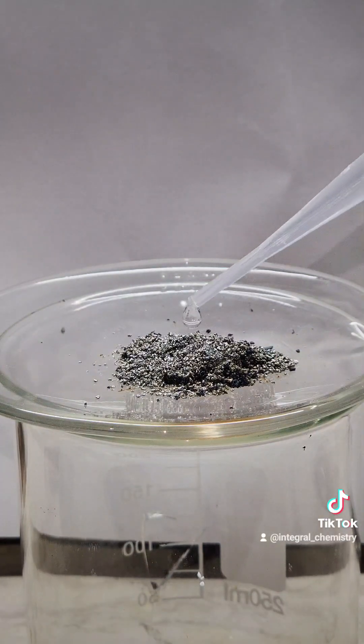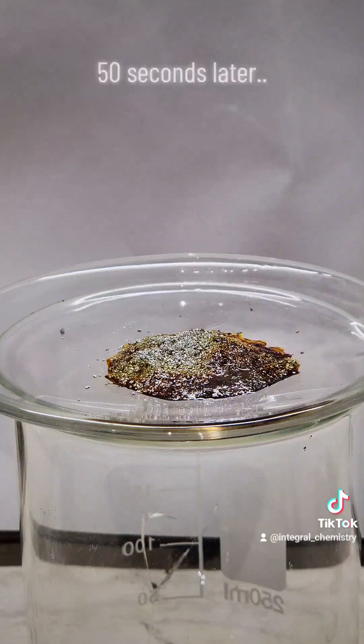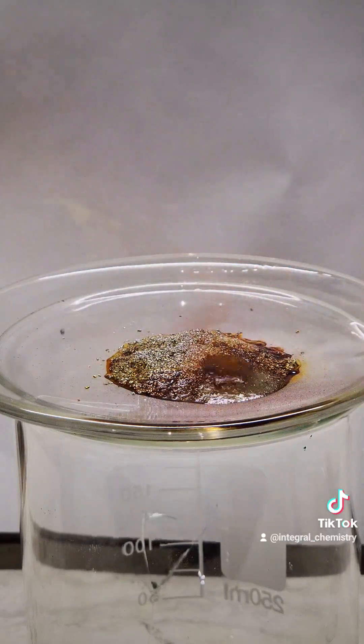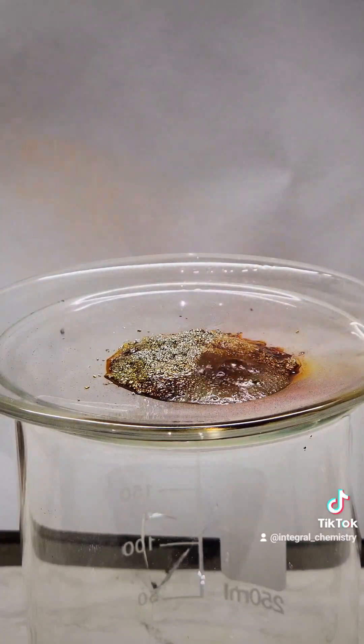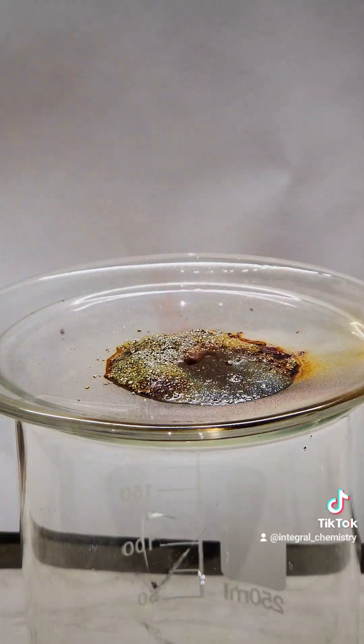I wouldn't recommend doing this reaction at scale, but with such a tiny amount, it's not too dangerous. And that's the entire process. I hope you found this video interesting, and if you liked it and want to see more like it, consider following for more.